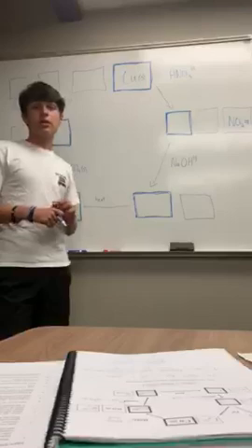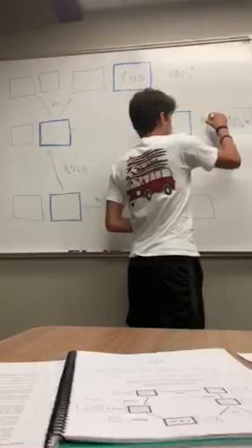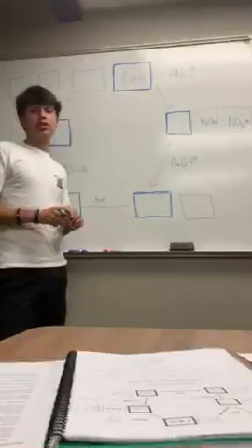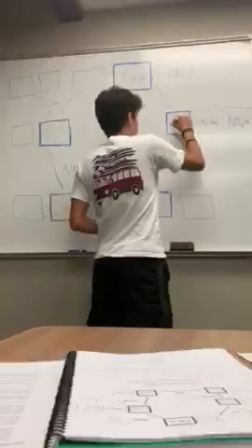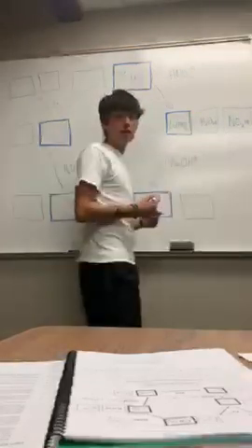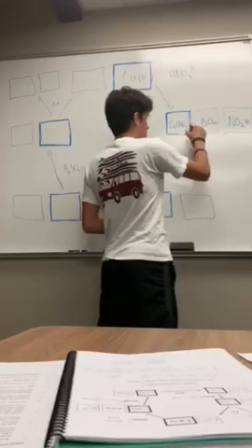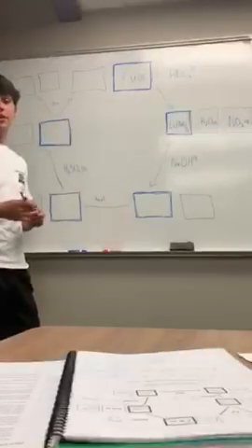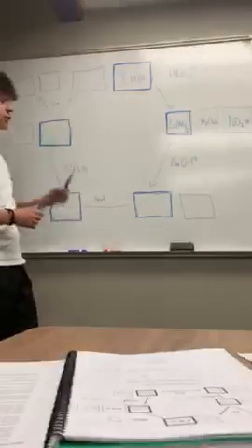After the solution was diluted with water, a liquid, it turned a light transparent blue color, which was copper nitrate. Copper nitrate is an aqueous solution. Since copper stays throughout the entire cycle, copper will always be in the bolded box.